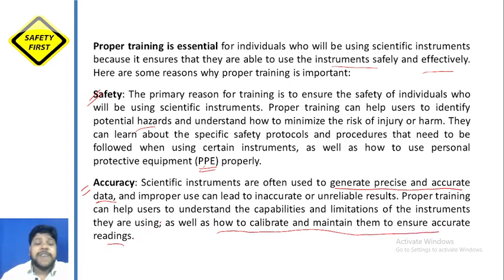So this is also very important from the point of view of the work we are doing in a laboratory. When we are trying to get some data, we are doing some measurements. A trained person can be very beneficial for the whole process being conducted. If you don't have a properly trained person, then you may compromise the total idea of the experiment.